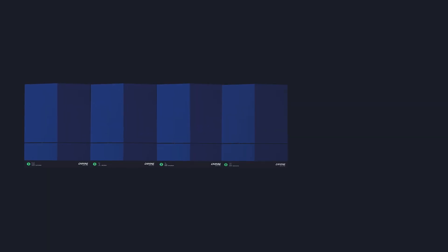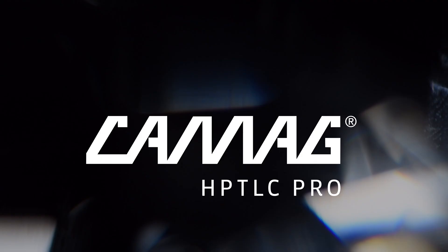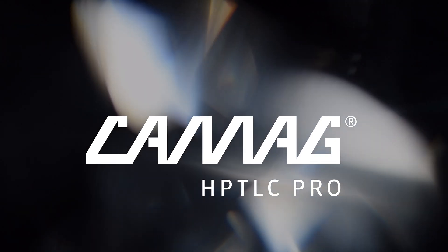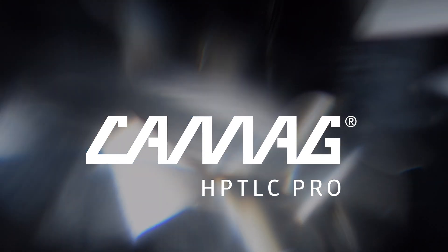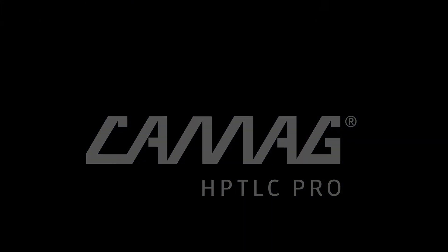HP TLC Pro. Leading high-performance thin layer chromatography to the next dimension.